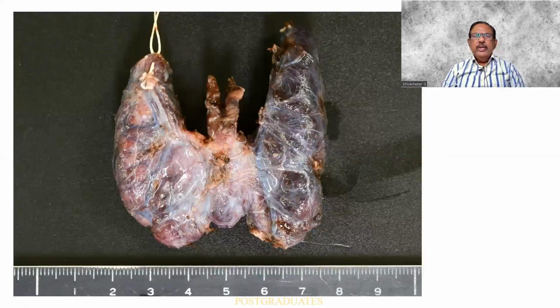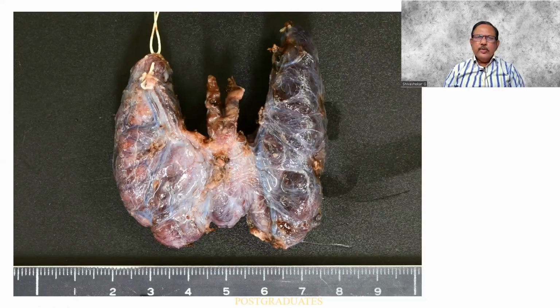Look at this. So describing a specimen will be mandatory. You are supposed to mention what type of a thyroidectomy it is and what are the lobes that you are seeing. What is the measurement of each, and whether the surrounding capsule is transparent? Are you able to see the underlying parenchyma? Is it smooth or is there a bosselation? And what are you finding at the isthmus? A bit of the pyramid is also seen over here. Similarly, the posterior surface. Any additions, etc., can be specifically mentioned. Measurements are mandatory, weighing is needed.